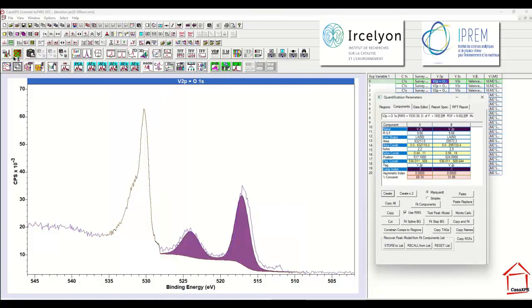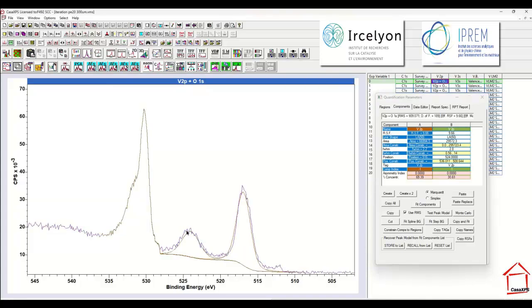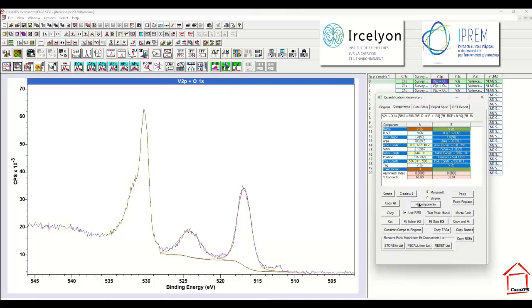So let's add a couple of peaks. I'll change the display mode so we can see these peaks, and if I say fit, I end up with a pair of peaks, and the ratio of these peaks looks like it is close to 2:1. So I've certainly improved the situation.